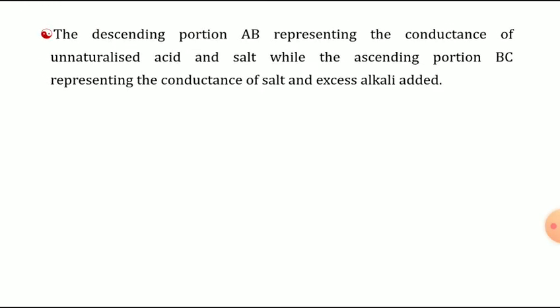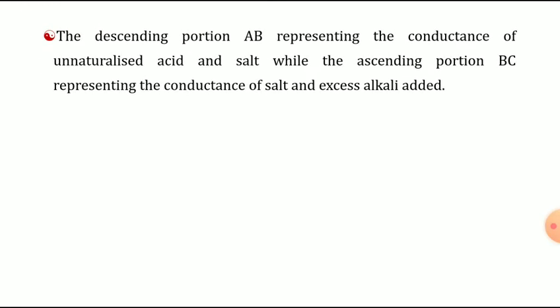Now we will see the conductivity cell, but before that, the descending portion AB represents the conductance of unneutralized acid and salt, while the ascending portion BC represents the conductance of salt and excess alkali added.